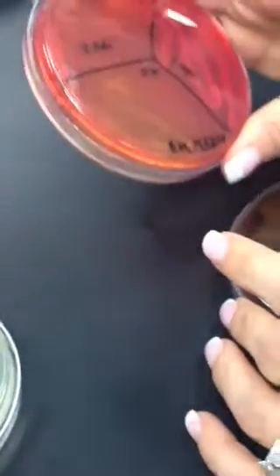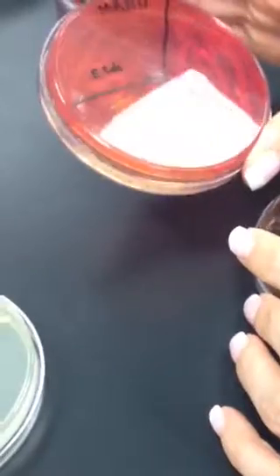So it's probably salmonella. And the last one, mannitol salt agar, is just to show you that what your unknown is not gram-positive. You do not have gram-positive Staphylococcus. Your unknown, because there was no growth on the mannitol salt agar. No growth. Did that help you understand?